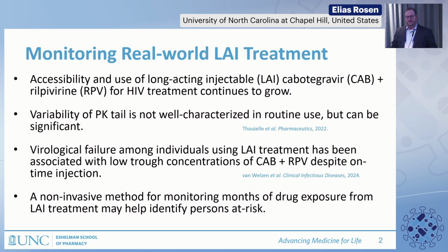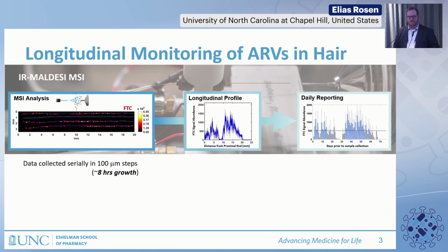So we believe that a non-invasive method for monitoring months-long exposure to drug provides the potential for an important support and identification of individuals who may be at risk for virological failure. We've developed an approach based on IR-MALDESI mass spectrometry imaging, which uses a focused laser to probe 100 micrometer features of hair strands to build a picture of antiretroviral accumulation within individual strands.